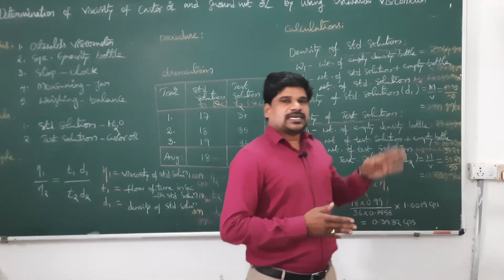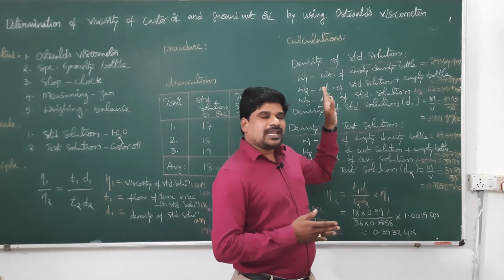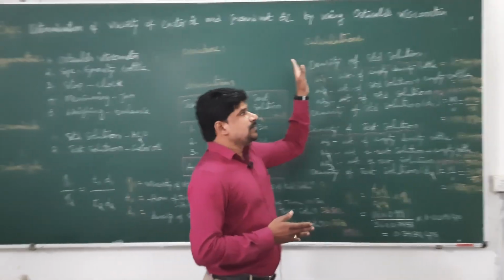So, from this experiment we can find out the viscosity of any given solution, such as castor oil. So, that is the experiment.